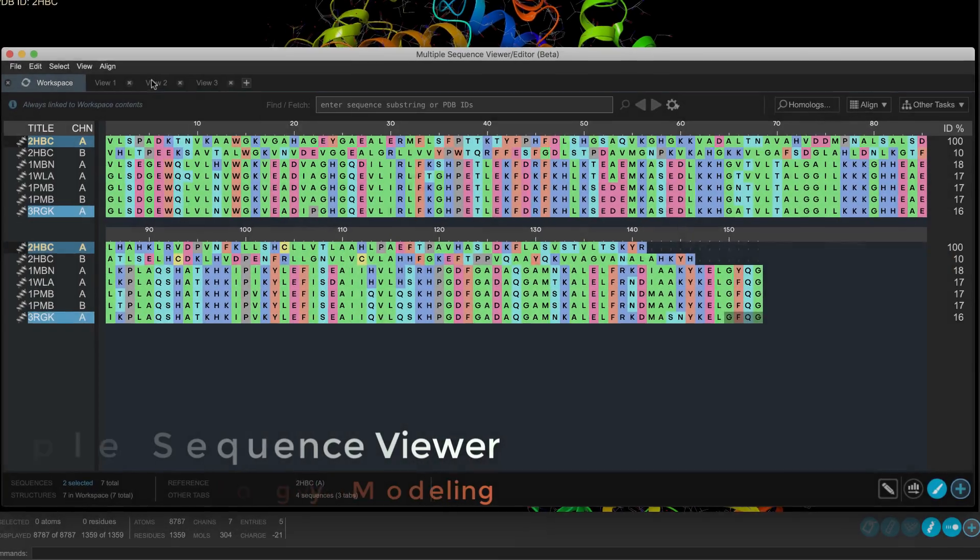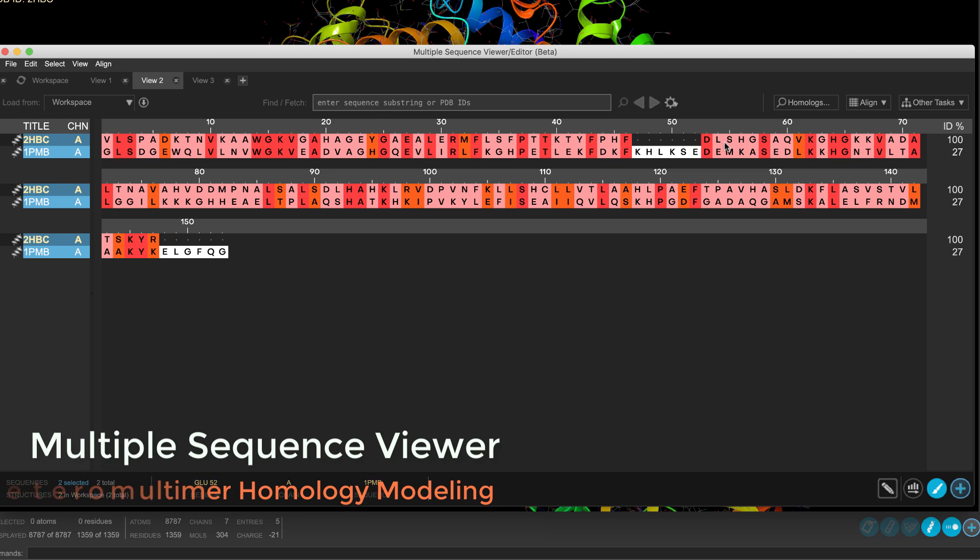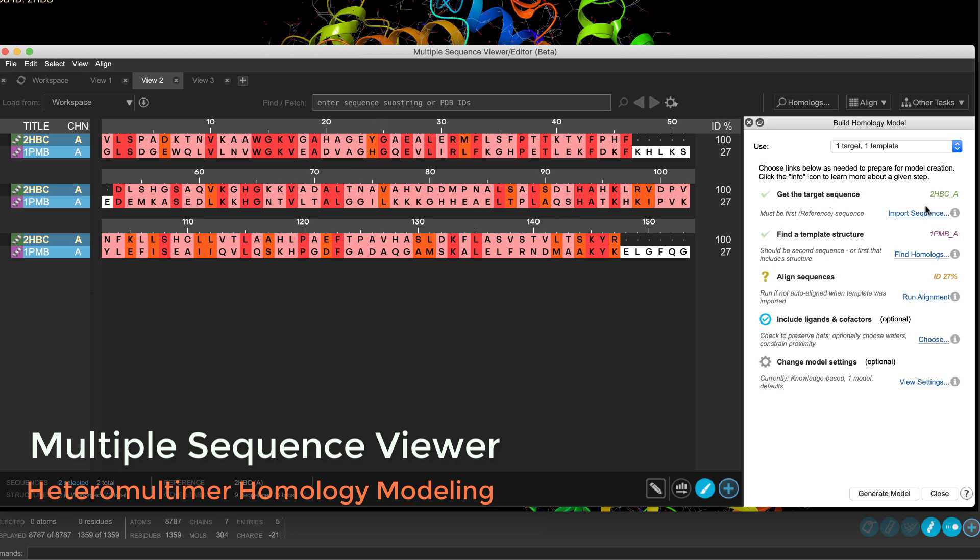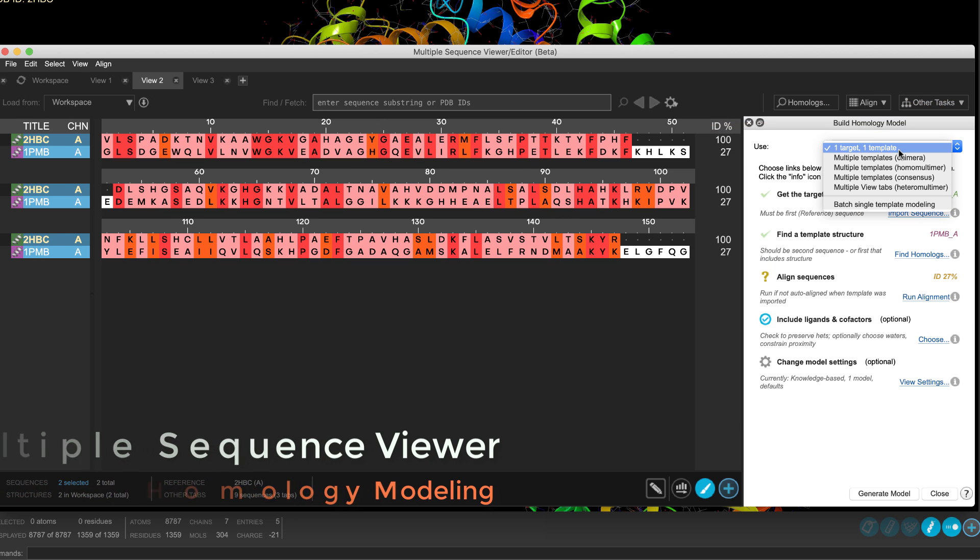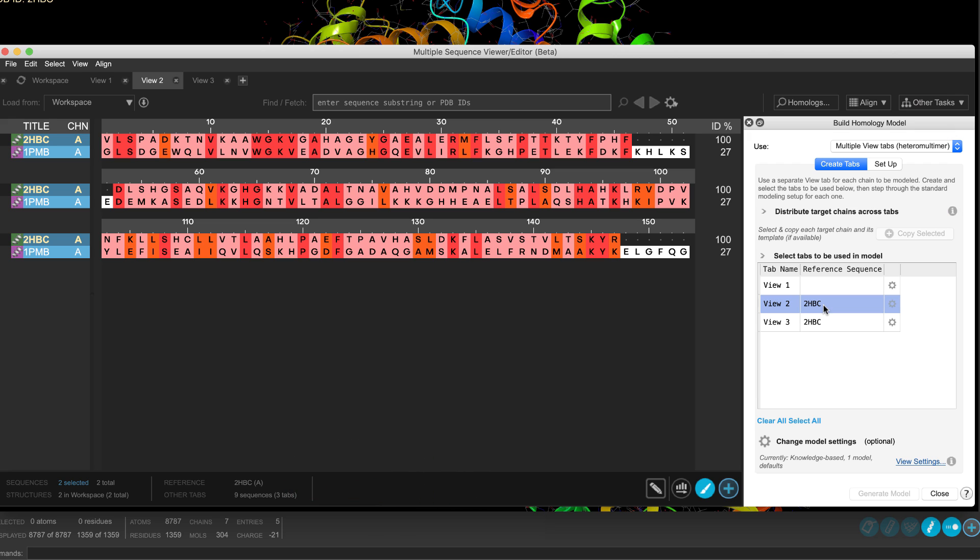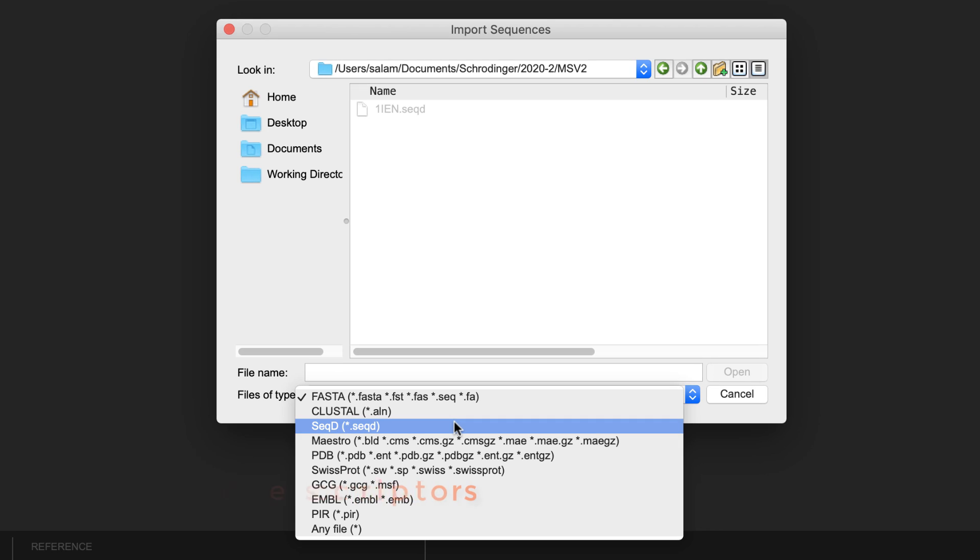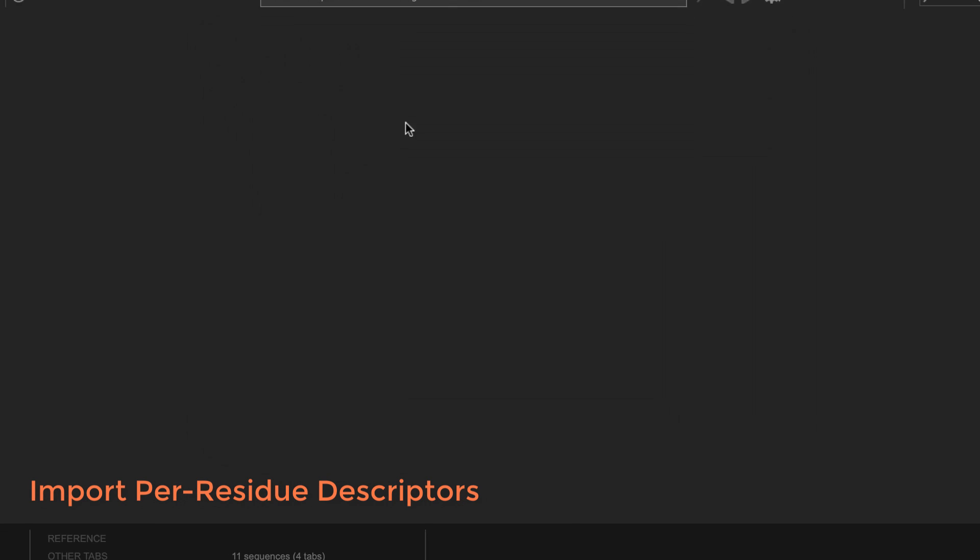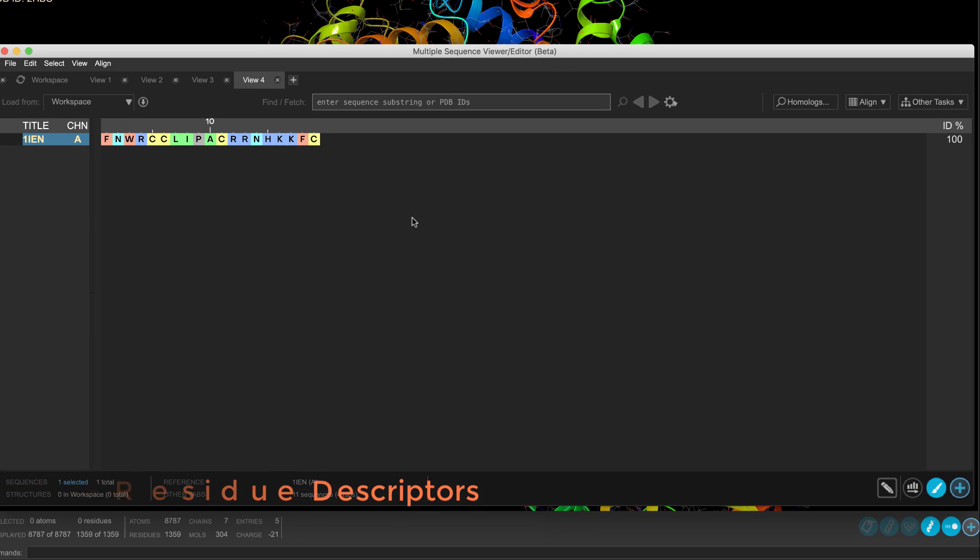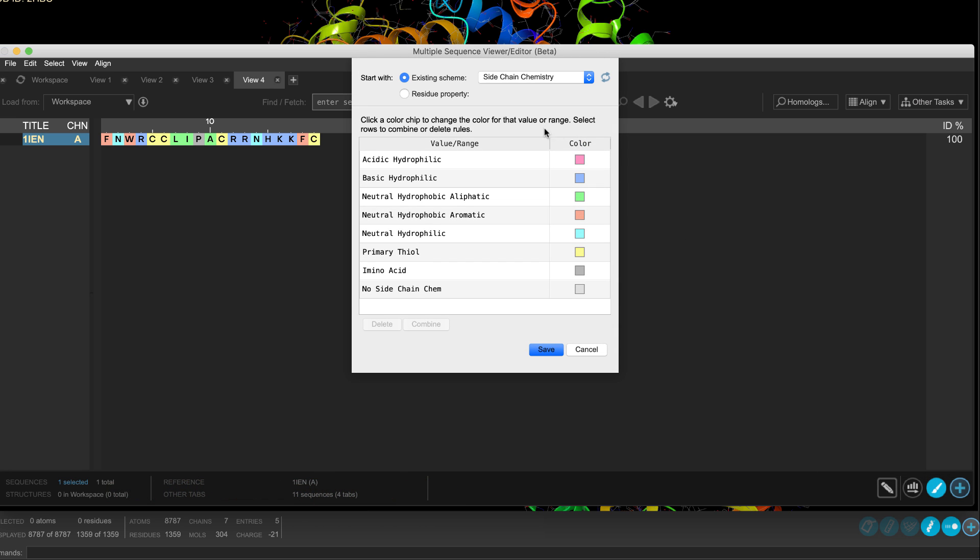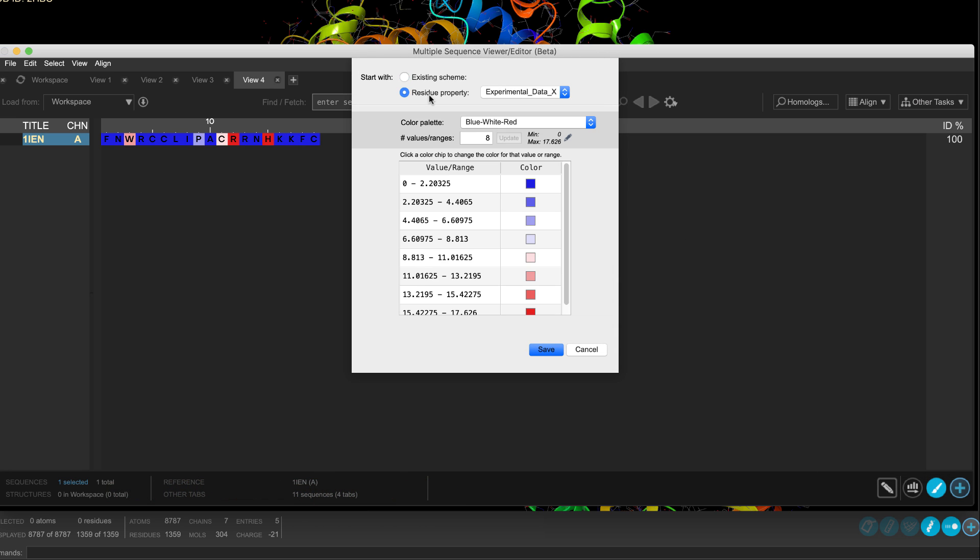Over in the multiple sequence viewer, still in beta, a heteromultimer homology modelling workflow has been introduced. This is used to build a multi-chain structure or several single-chain structures from a set of individually modelled structures. Also, now it's possible to import sequences with per-residue descriptor information. The sequences can then be visualized and annotated, for example, with the Color by Residue property color scheme.